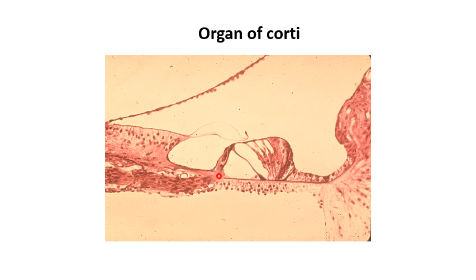Here are the outer and inner pillar cells, the outer and inner phalangeal cells, and here are the outer hair cells and inner hair cells.